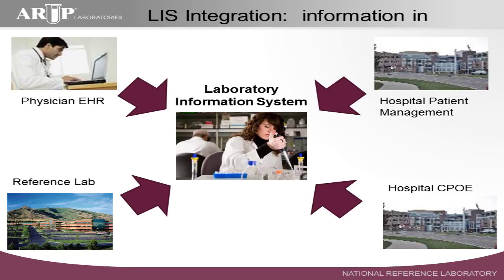Over here on the right side, hospital CPOE, same thing. It's part of a hospital information system, or EMR. CPOE, clinical provider order entry, is the acronym. So that's where most clinicians do their ordering, whether it's lab, radiology, pharmacy, whatever. It's the CPOE function of an information system. Physician EMR, again, if the hospital is really integrated well with the doctor's offices in their area, in their community, you'll have orders maybe flowing directly in from the doctor's office, their EMR, into the laboratory information system.